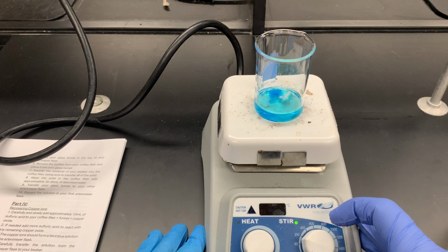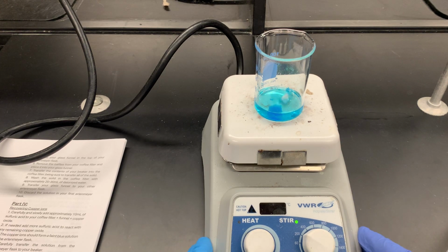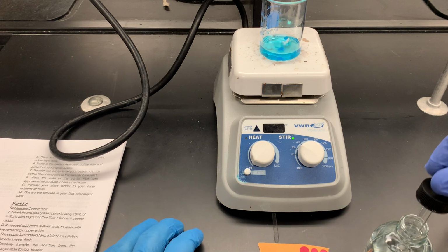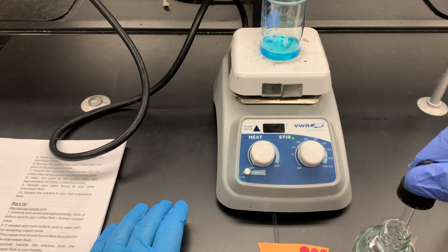Now, I would say that at this point in time, it really doesn't hurt to adjust the speed of your stirrer. One thing that you want to be cautious of, though, is you don't want the stirrer to be going so fast that it basically is bouncing all over the place. Now, we're going to be continuously checking the pH of our solution. So again, going back to the pH paper, and it's still pretty acidic. So we'll continue doing maybe 10, 15 drops at a time.